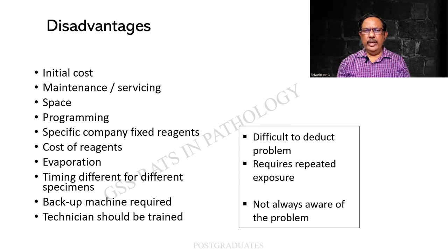A backup machine will definitely be required because of any technical problem. If this machine is going to shut down, you cannot stop the histo processing. We cannot ask them to stop the surgeries in the theater. Everything will be continuing. Therefore, a backup machine is required. And again, the same story of space, cost, etc. And the technicians will need to be well trained to handle such things.